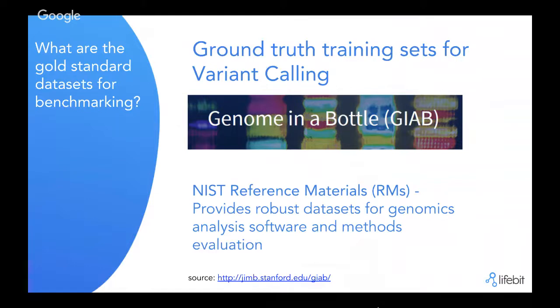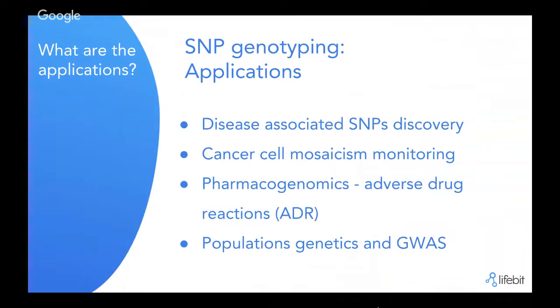And that actually defines, across a set of samples and a set of sequencing technologies, just raw data that has been used in order to find variants. And since this is a reference data set, or a ground truth data set, for variant calling, what it also defines are the true positives that each method or tool should aim to find once you run any kind of analysis. And this reference data set is also quite well used in order to train different methods and to benchmark the results of any new tool.